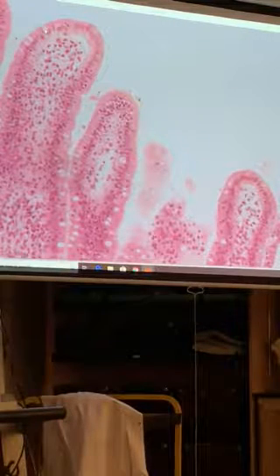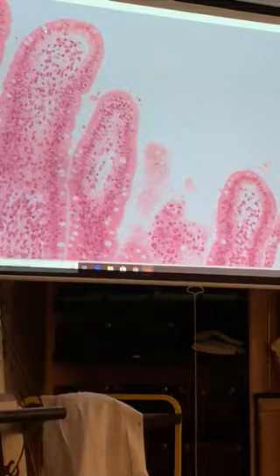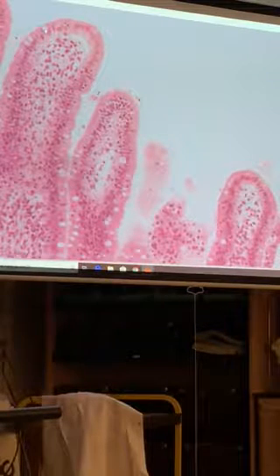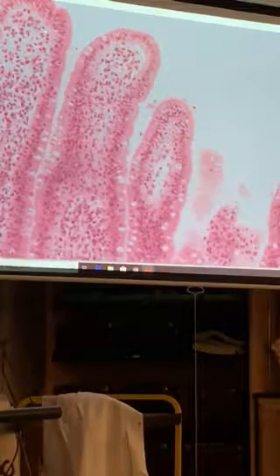Here's a bigger one. There, name that. Here, here, here, here. Name the white or clear oval-shaped structure. Okay, next up, number 15.